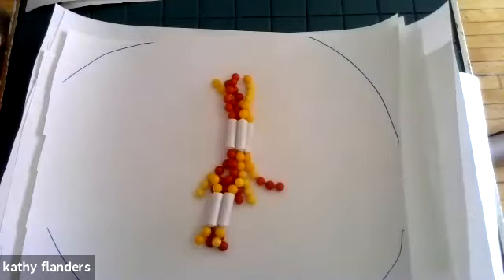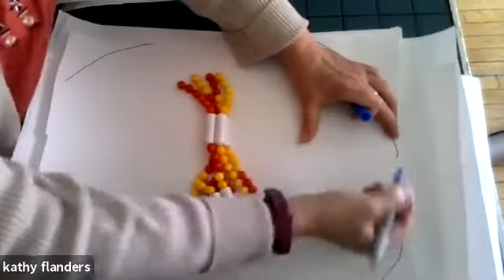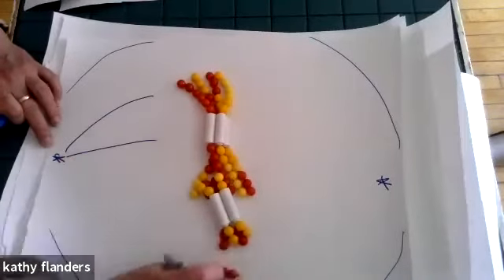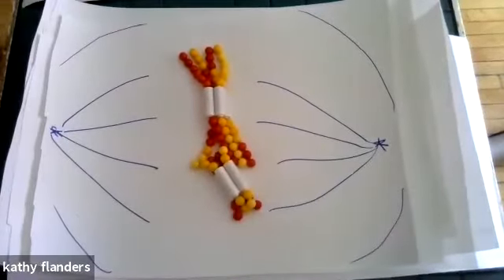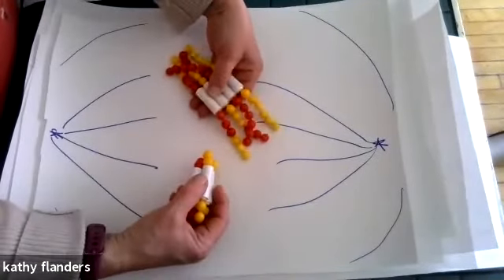Metaphase 1. So remember now I don't have a nucleus or a nuclear membrane, right? But I do have my centrioles and my spindle forming. And in metaphase 1, I'm still dealing with homologous pairs.